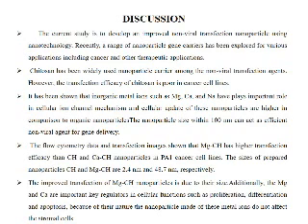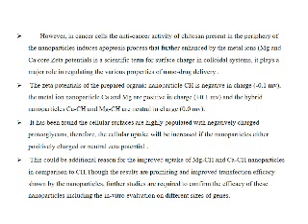The flow cytometer data and transfection images show that magnesium chitosan has higher transfection efficiency than chitosan and calcium chitosan nanoparticles in PA1 cells. This is due to their size, because the chitosan is just 2.4 nanometer and the magnesium chitosan is just 48.7 nanometer, and additionally magnesium and calcium are important key regulators in cellular functions such as proliferation, differentiation, and apoptosis. Because of this nature, it has shown a very good result.